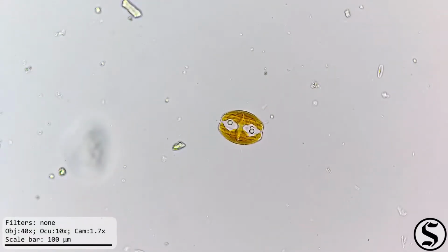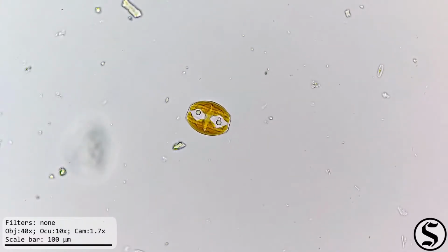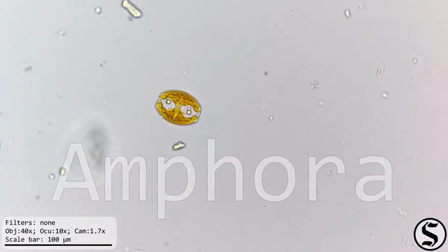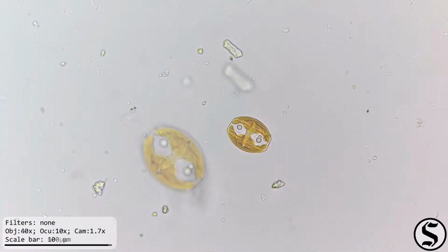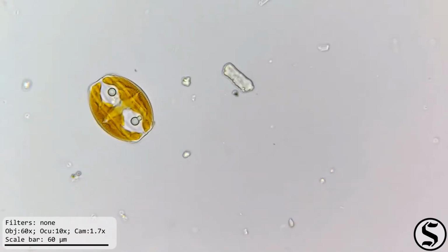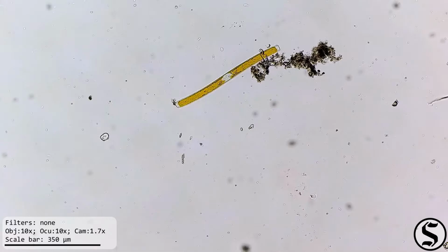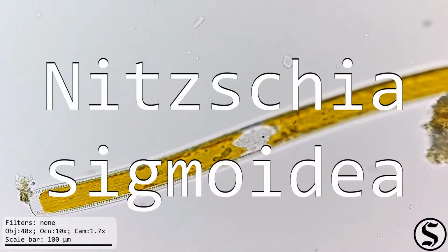Here's another diatom, very distinctive shape. We can recognize this to be of the genus Amphora. There were a lot of diatoms in here. This one is Nitzschia sigmoidea.